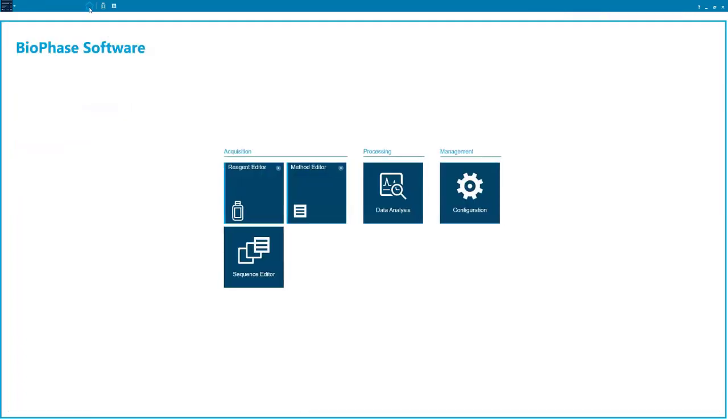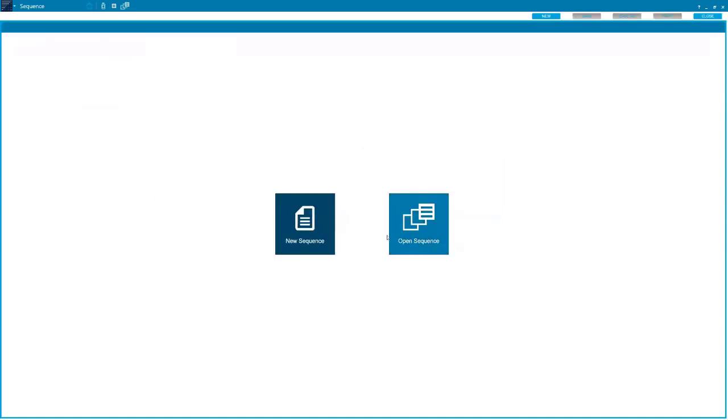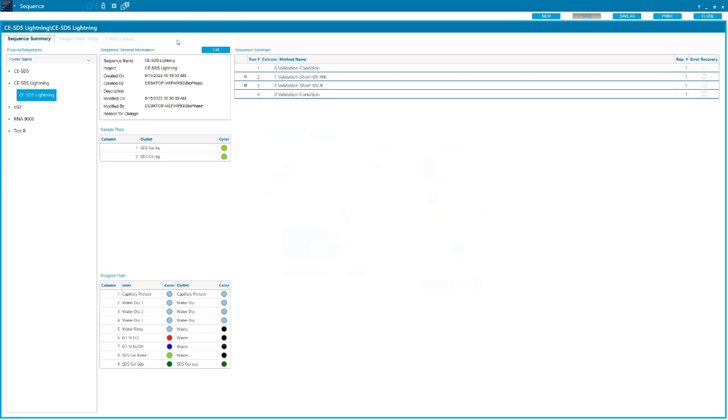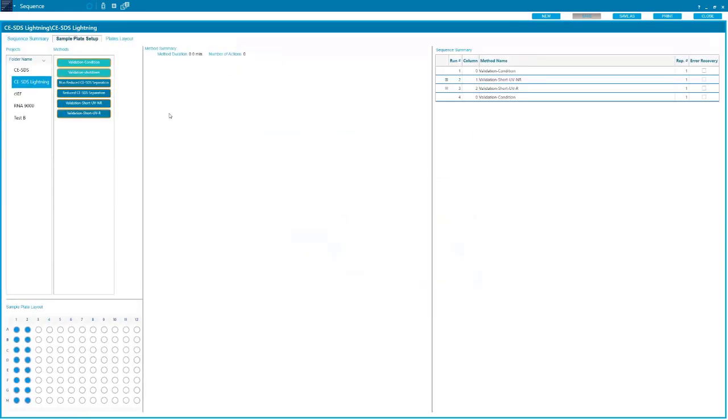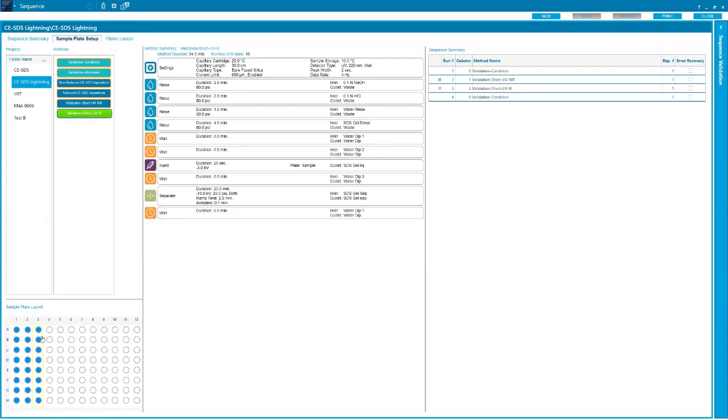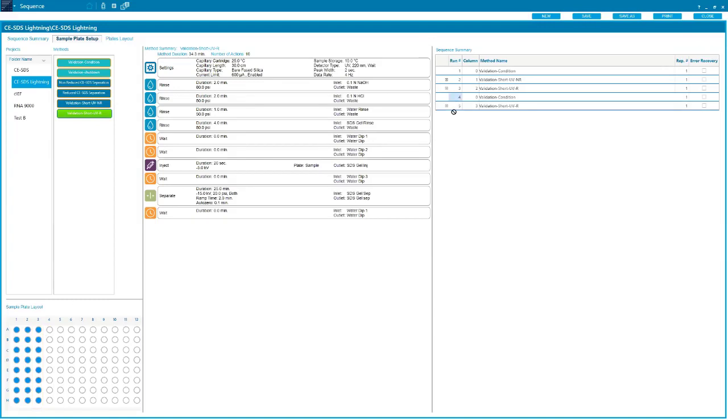What is very important to everyone, actually, let's go to the sequence. So now we can open up our sequence, because I love the BioPhase software. I love the drag and drop. If we go to our sequence, we want to open a sequence here. We have our 96-hole plate in the bottom left corner. We have the well locations of where our samples are located. Let's do something like this. And then when we want to run a method, all we have to do is take this method, drag it down. We see that the column there is highlighted, and then it will populate over here on the right side.